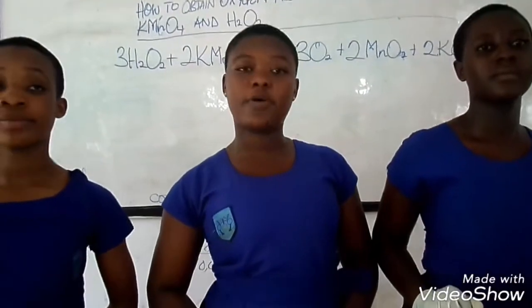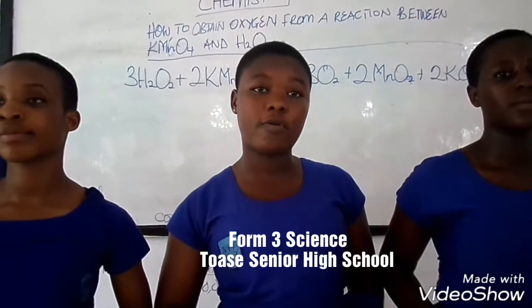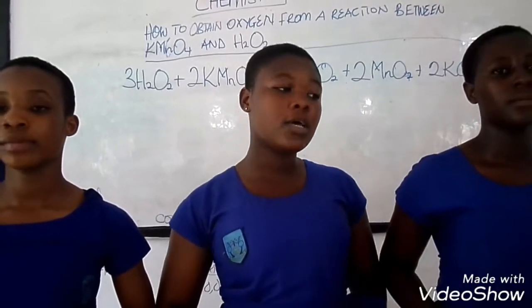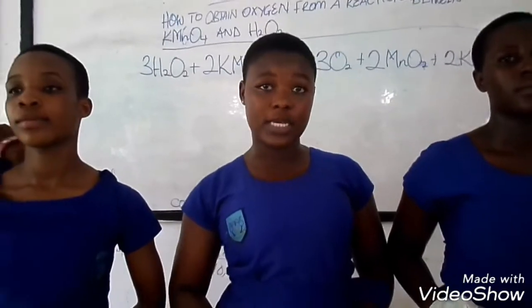We are here to perform an experiment on how to obtain oxygen from a reaction between potassium permanganate and hydrogen peroxide.